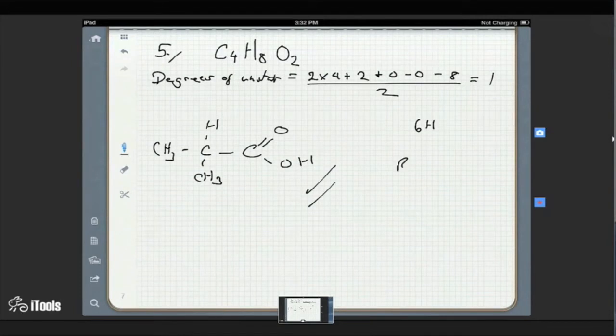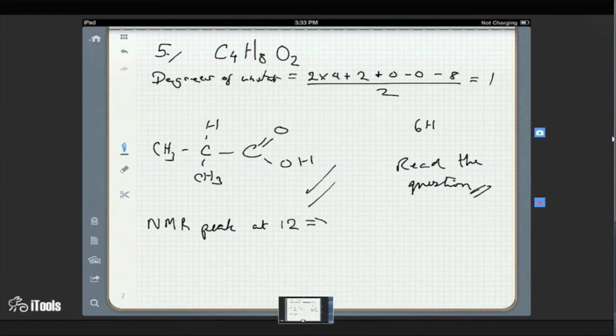It looks like sometimes your instructor's spectrums don't include all the peaks. Sometimes the peaks are in the text. So better to learn that now than to learn it during the test. Do you see why he did that? Why is it in the text and not in the chart? Because he wanted to show, kind of like when you're graphing something and you want to take off one part of the graph so that you can show clearly the rest of the graph.